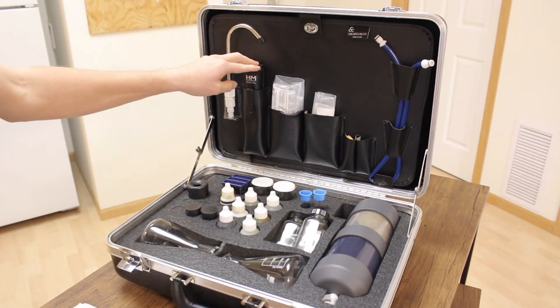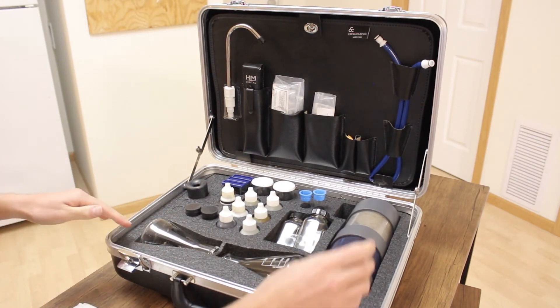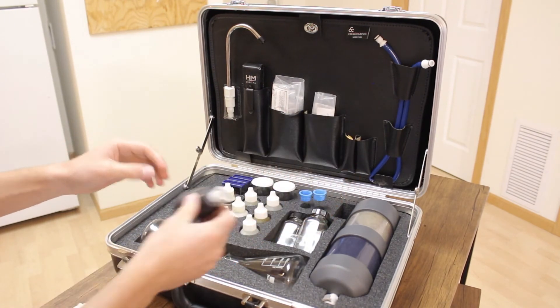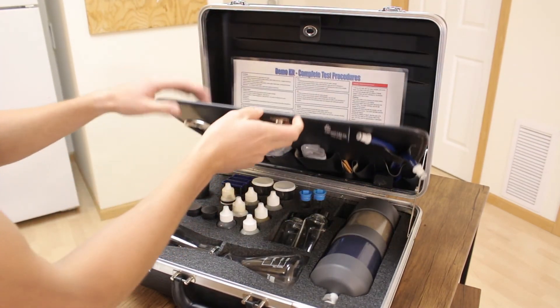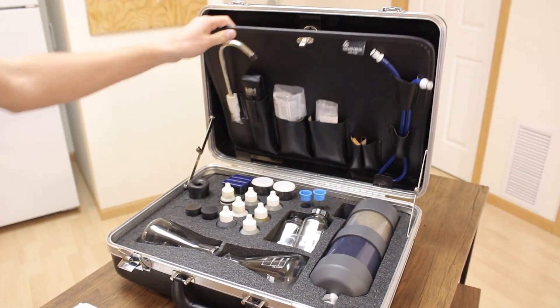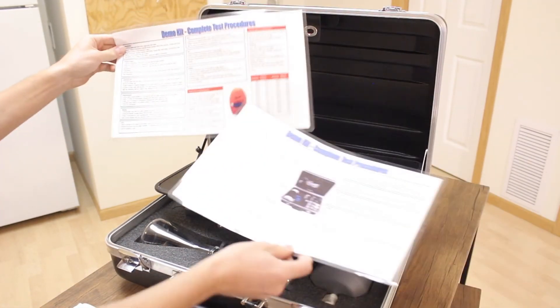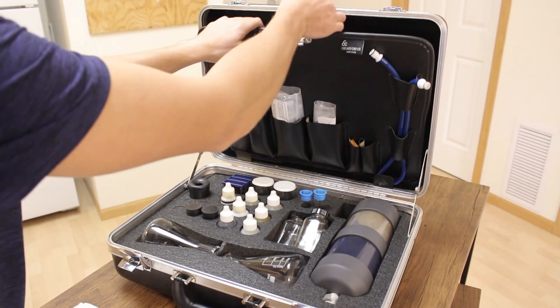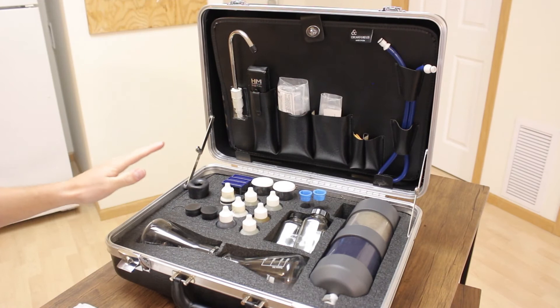It also comes with the TDS meter. The way to make it fit best inside the kit is to take off the part where it connects to the sink and put it in separately — it fits in here nicely and there's plenty of room. The nice thing about this kit is it has a lot of extra space in the back so I can put my sales items back there, and it does come with the complete testing procedures. I've not run out of space back there, which is pretty convenient for me.